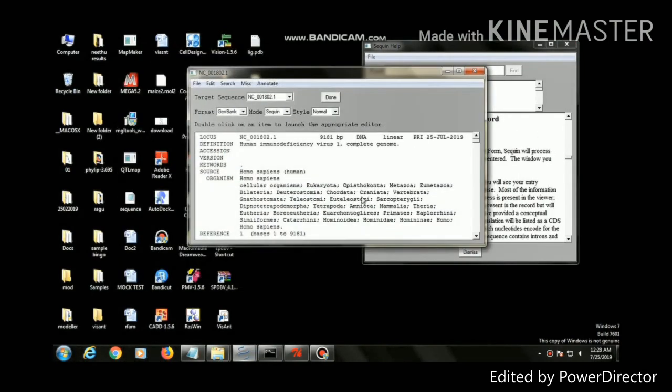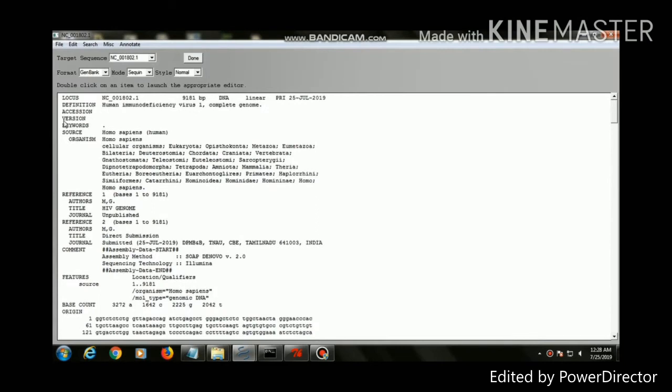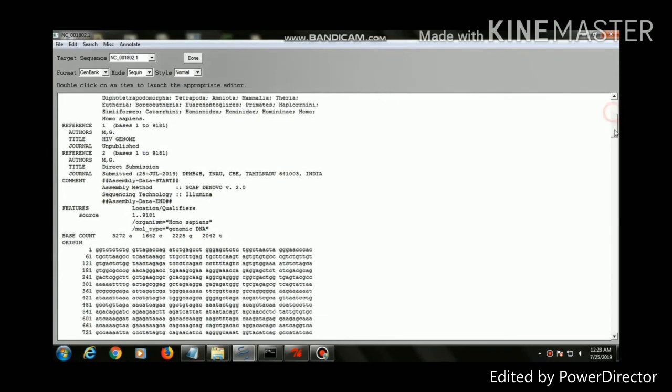Then the tool gives the sequence file format. The file contents, target sequence, the file format, locus, definition, accession version, keywords, source organism, reference of authors.